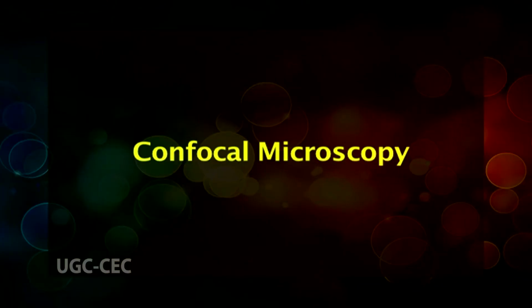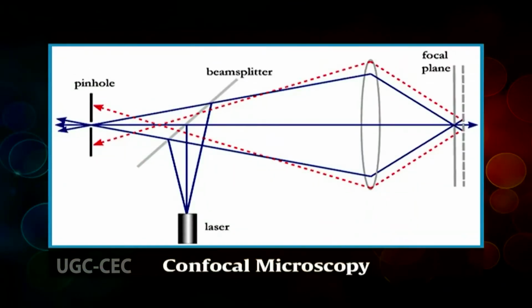Third is confocal microscopy. Although conventional light and fluorescence microscopy allow the examination of both living and fixed specimens, certain problems exist with these techniques.